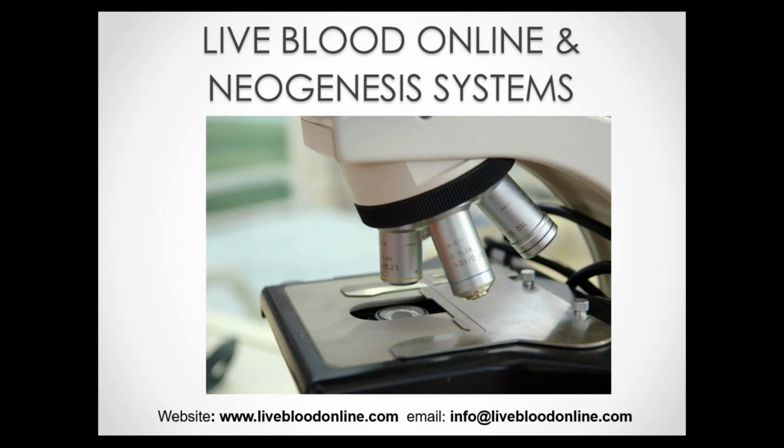This is also one of the main reasons why live blood analysis is not really fully accepted by the conventional medical field. We are using a device here that can actually detect conditions that conventional medicine does not recognize as being real conditions. For example, candida, the need for detoxification, heavy metal toxicity, latent tissue acidosis, and so on. So we have a tool here that can actually accurately detect those conditions. So it's very difficult and rather unlikely that it would be accepted by conventional medicine.